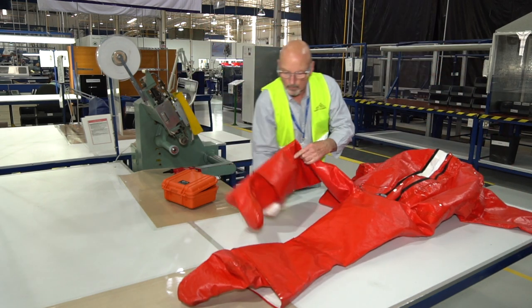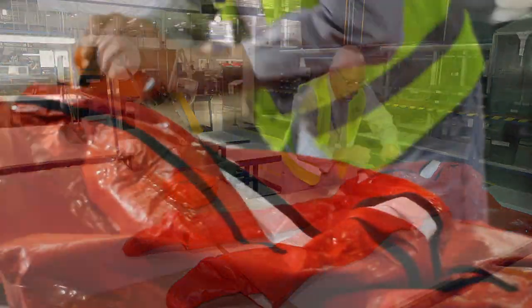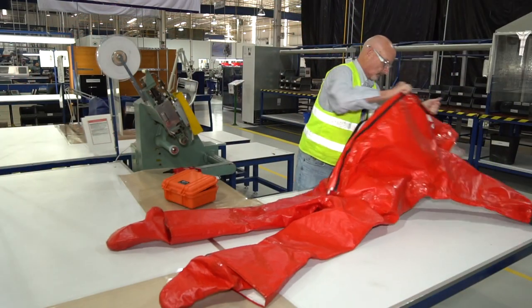Unpack the suit and lay it on a flat, clean surface, preferably a table. With the suit visor side down, open the protective zipper flaps and open the suit.